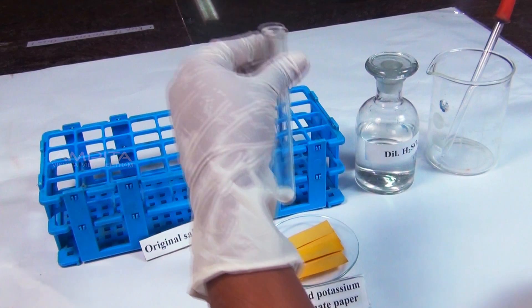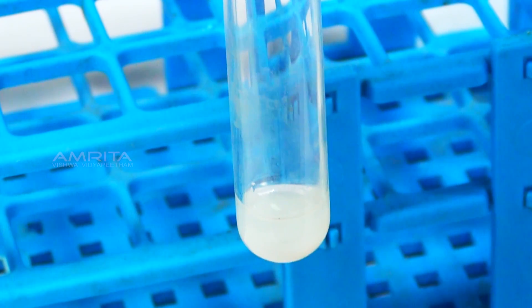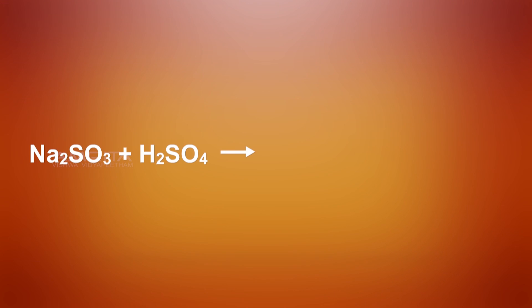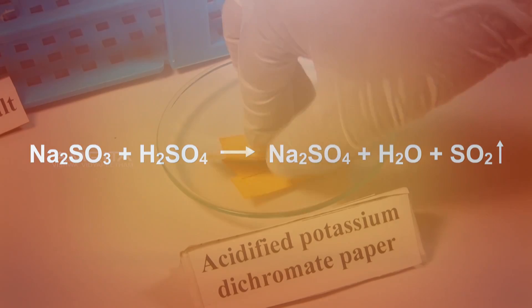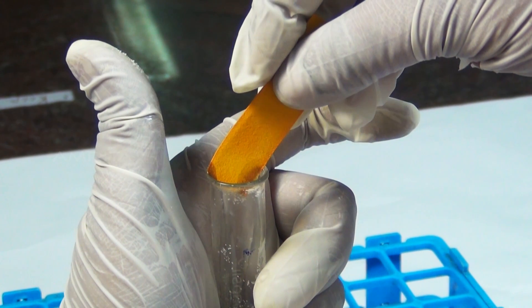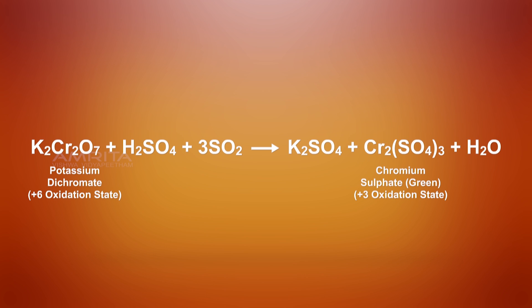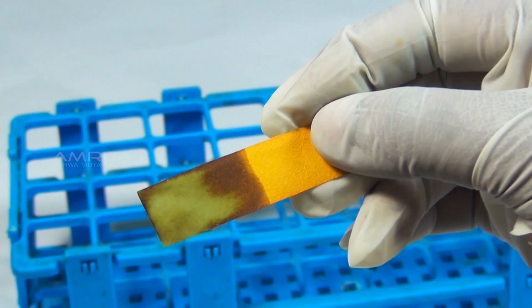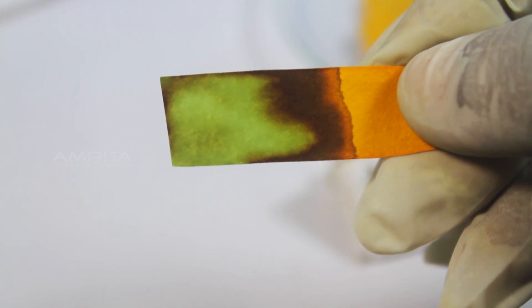Procedure: Take a small quantity of salt in the test tube. To this, add a small quantity of dilute sulphuric acid using the dropper. Sulphite reacts with dilute sulphuric acid to form colourless sulphur dioxide gas with pungent smell. Place an acidified potassium dichromate paper over the mouth of the test tube. In the presence of acid, sulphur dioxide reduces chromium in potassium dichromate from +6 to +3 oxidation state. Chromium in the +3 oxidation state gives green colour to the acidified potassium dichromate paper.